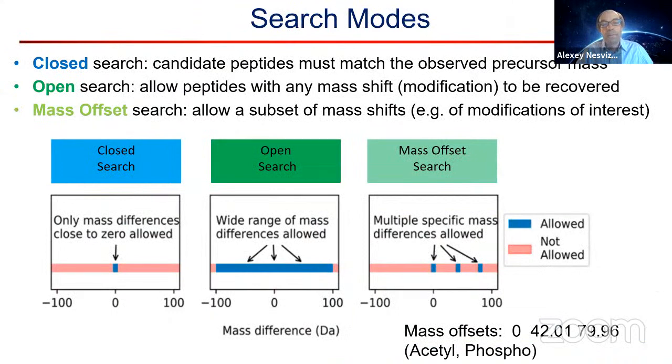And to summarize what we have for open searching as workflows, in addition to the conventional closed search, that's really where we search for specific peptides that have mass to charge ratio of the peptide matching the observed mass to charge ratio of the experimental spectrum, really looking for unmodified peptides only or peptides containing specified variable modifications and maybe isotope errors.